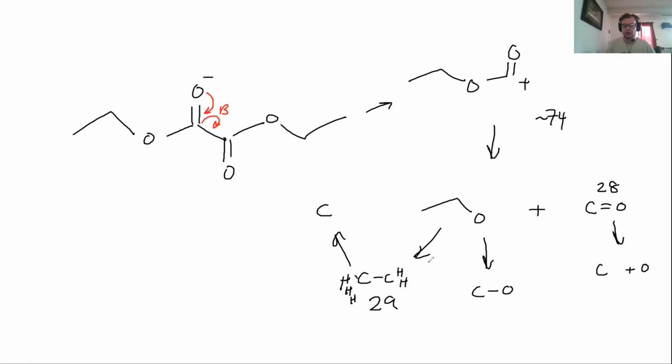That's how we get the 29, which is the most common, just the oxygen by itself. This way we'd have these 2 products, and we could get, most likely, a carbon with 2 hydrogens on it. And this one would probably take the 3 hydrogens. And this is why the 31 peak is higher than the 30 peak. So this would be 31.